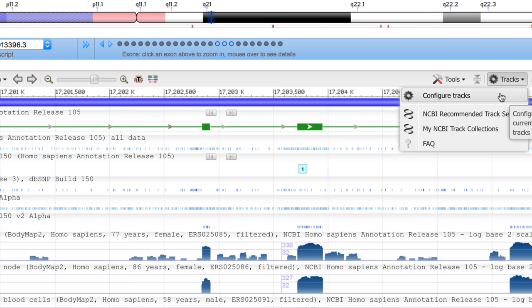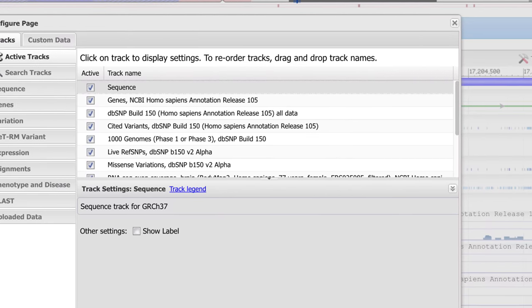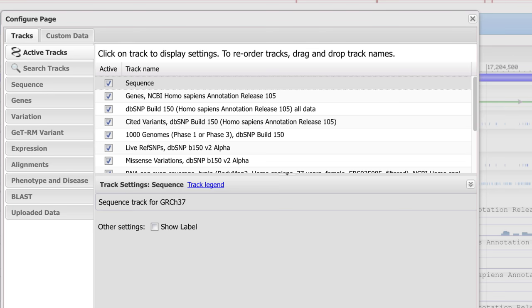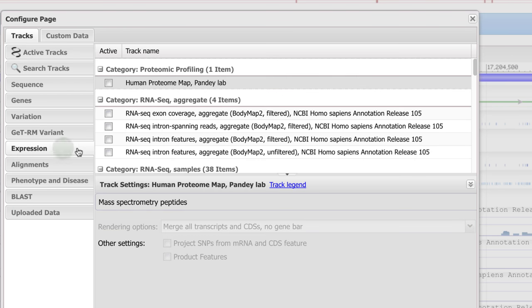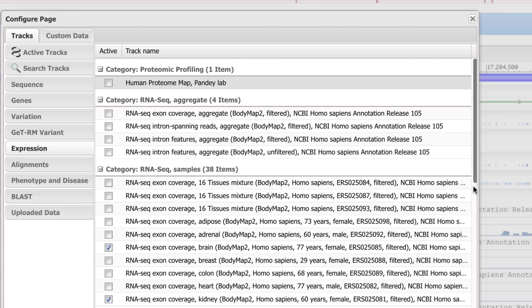There is also a configuration menu for choosing among hundreds of tracks that we provide, including expression tracks of RNA-seq data and many new variation tracks.